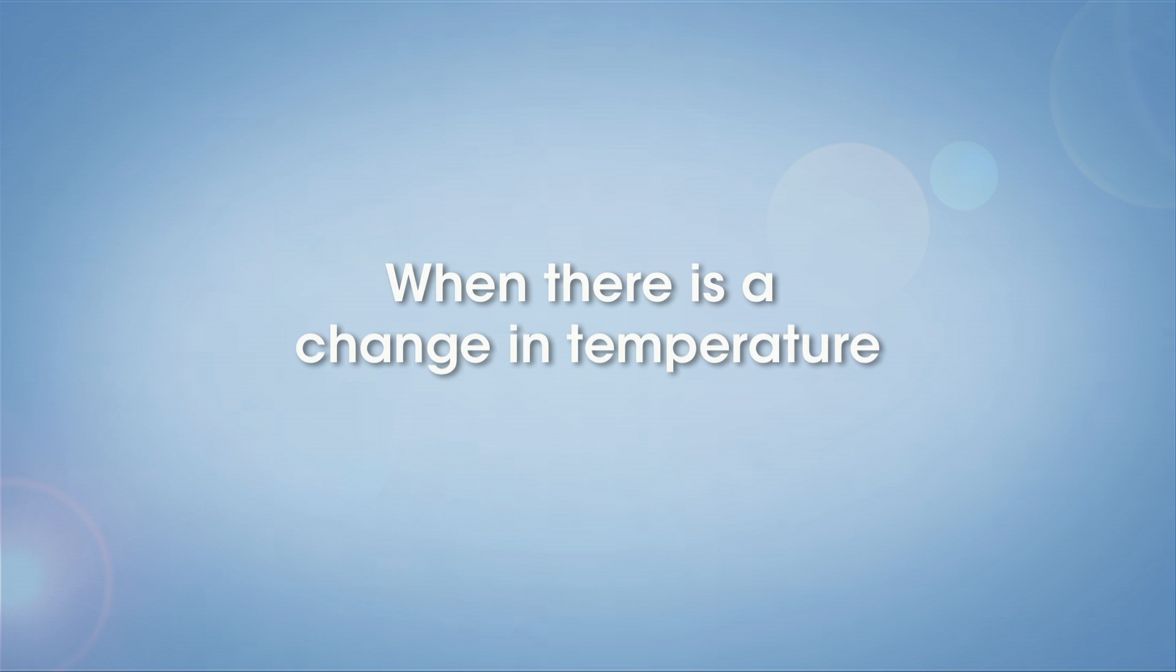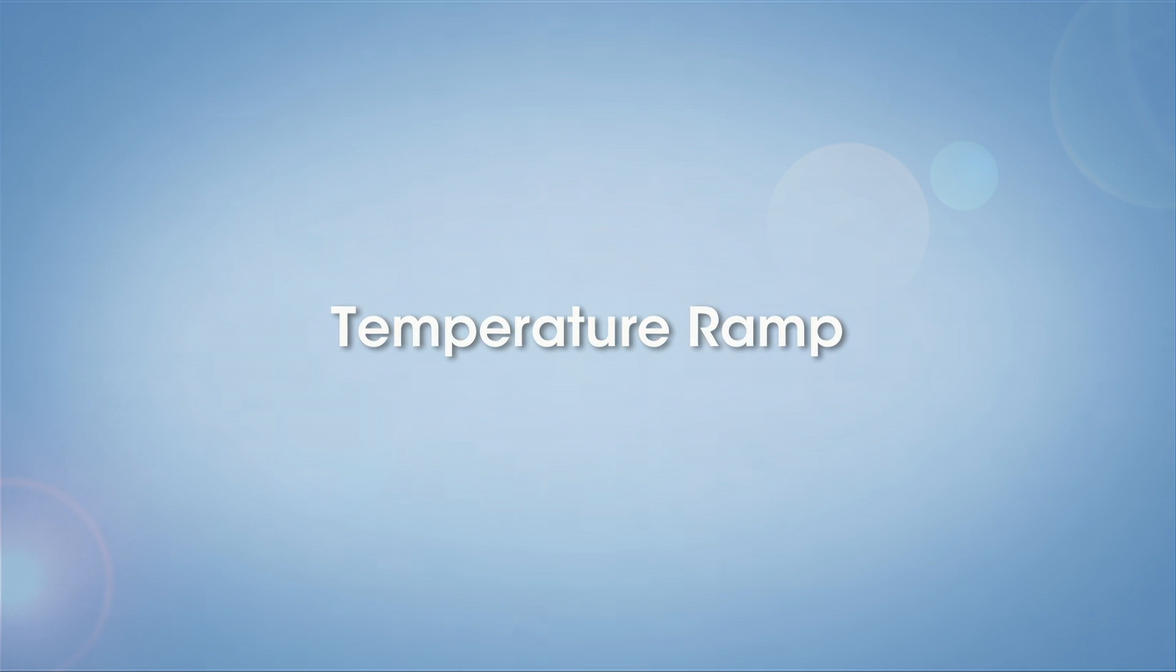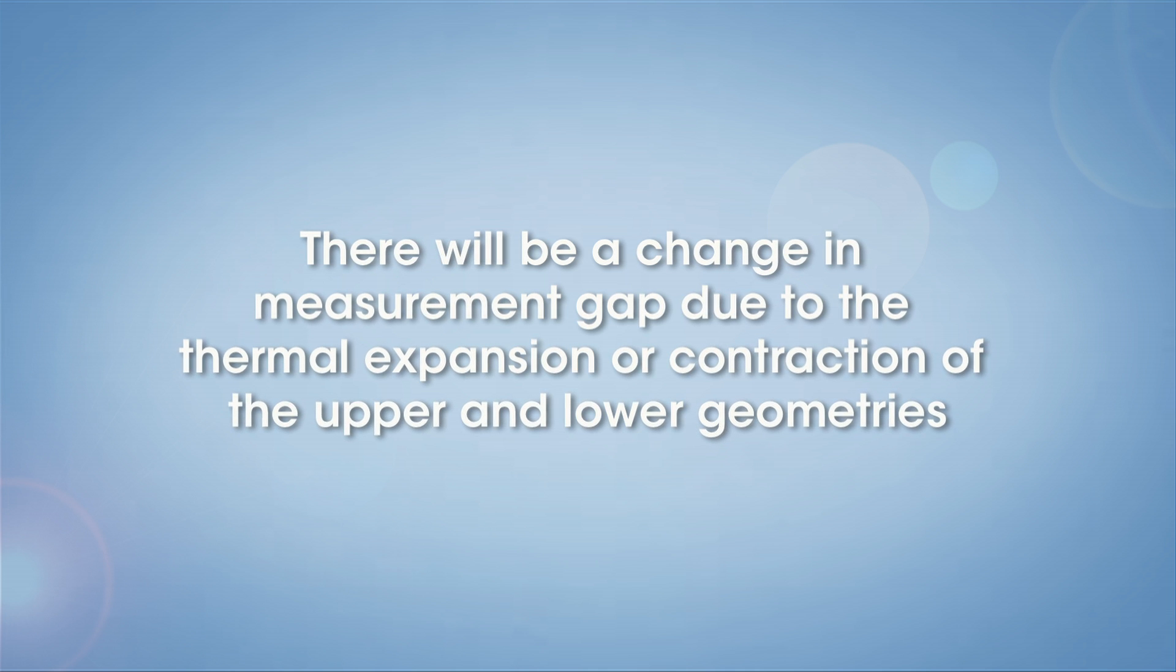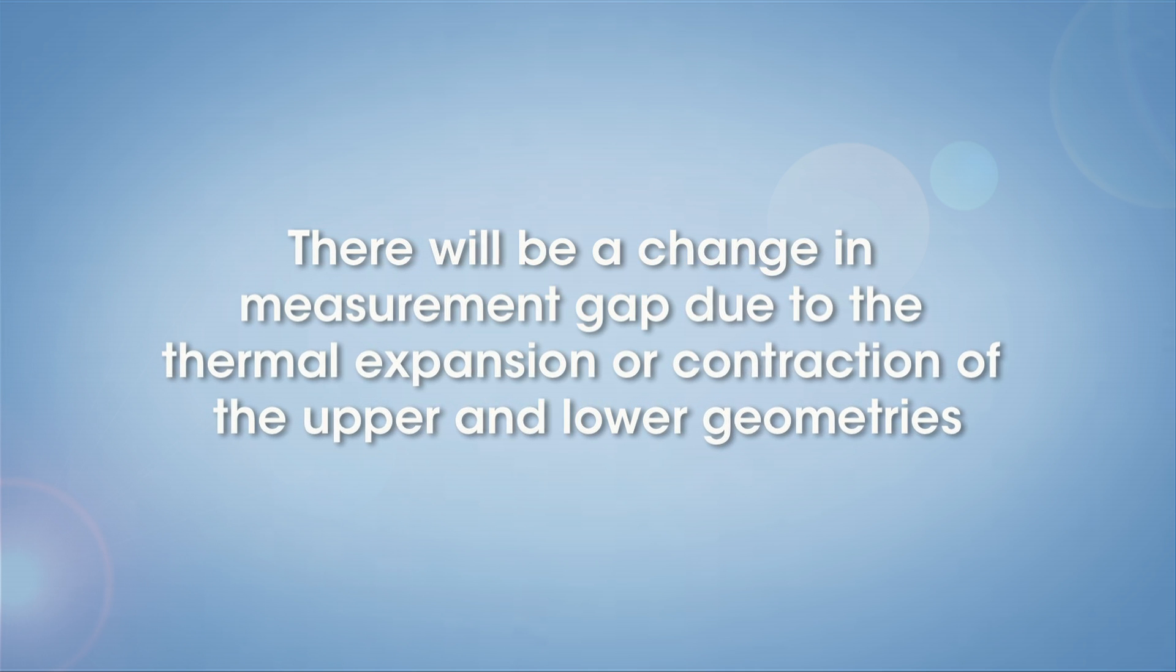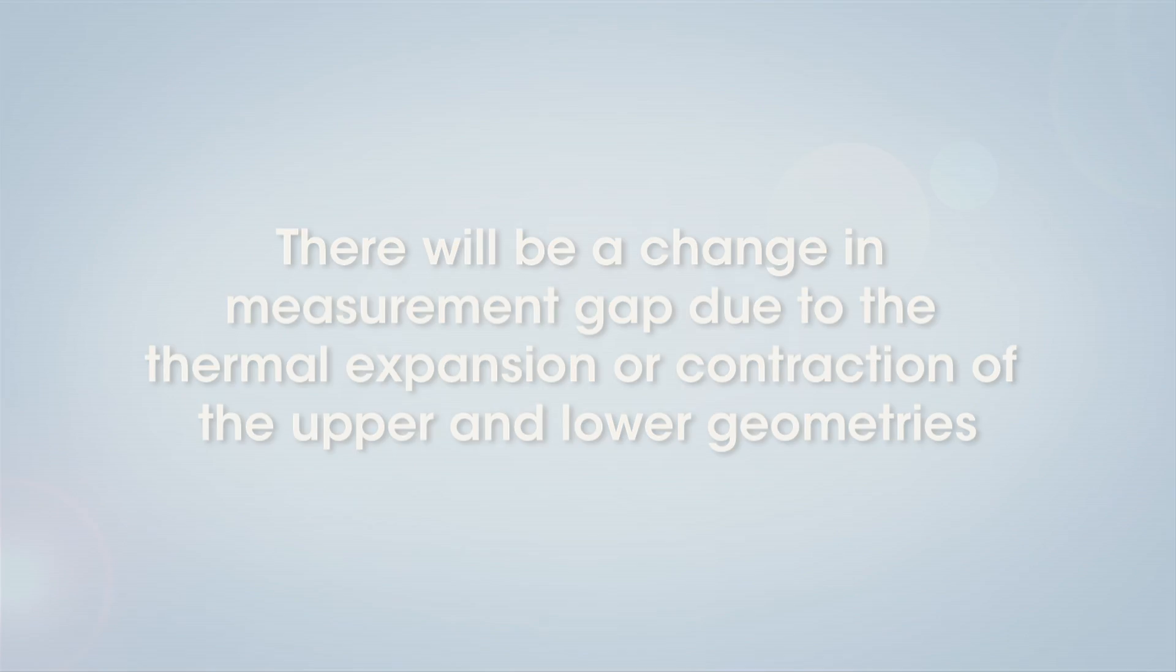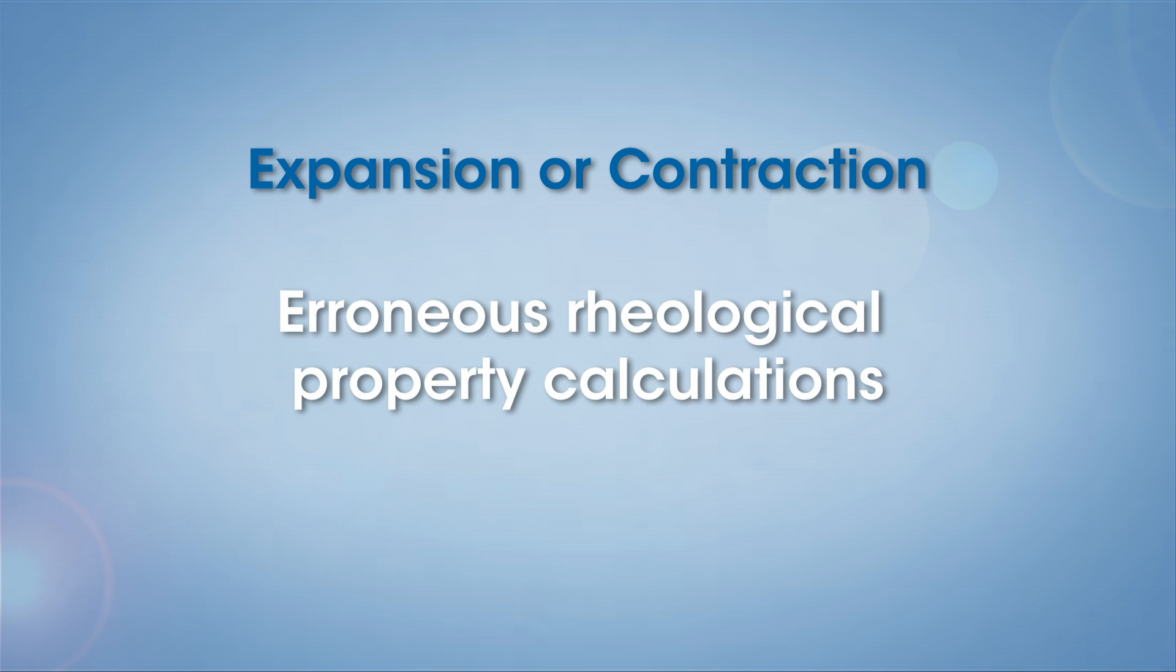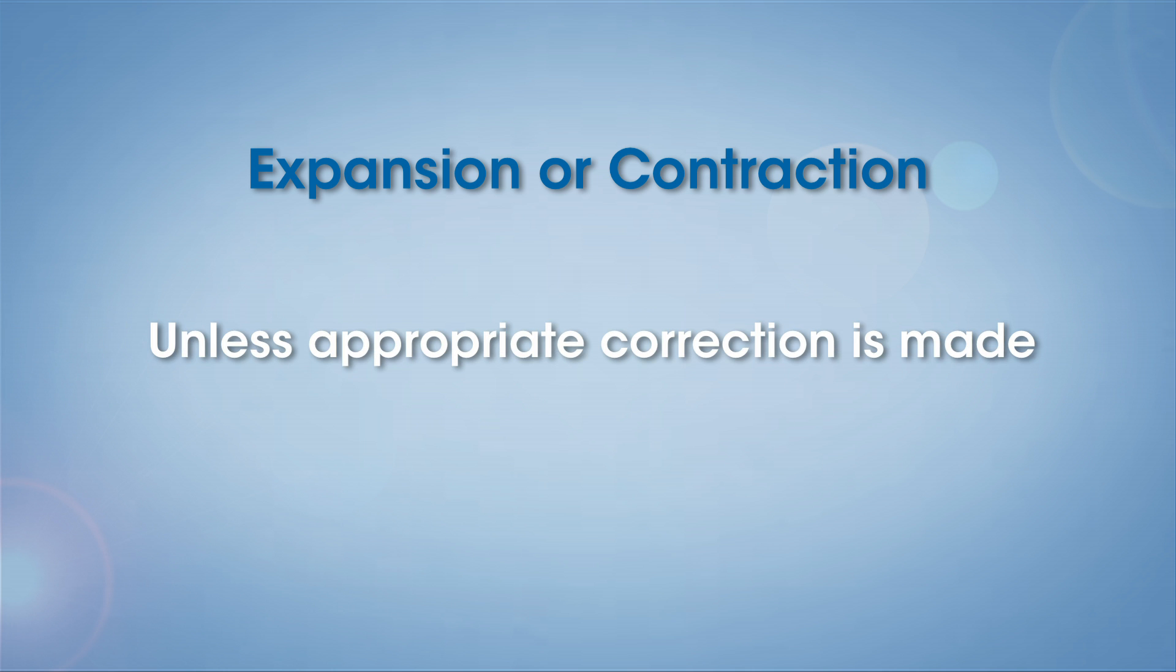However, when there is a change in temperature, like in a temperature ramp or sweep experiment, there will be a change in measurement gap due to the thermal expansion or contraction of the upper and lower geometries. This expansion or contraction will cause erroneous rheological property calculations unless appropriate correction is made.